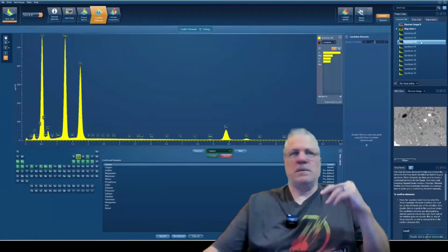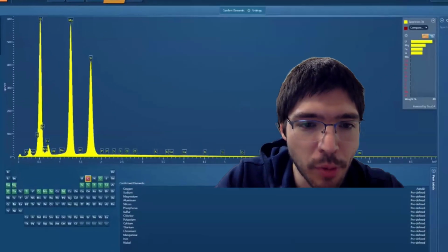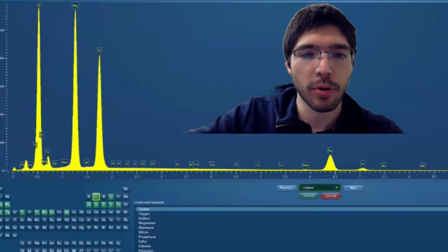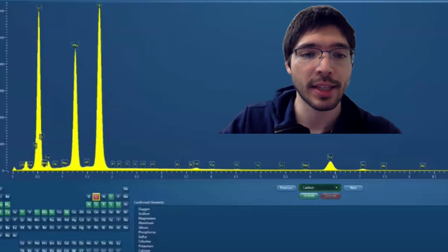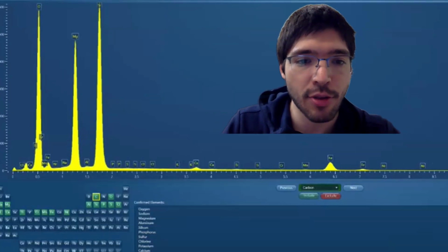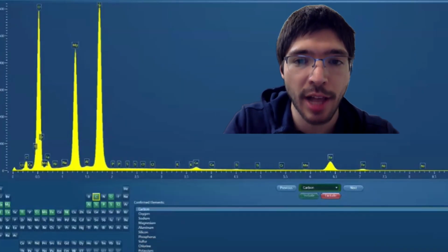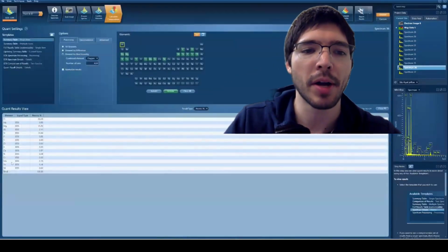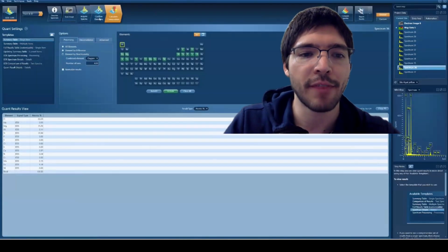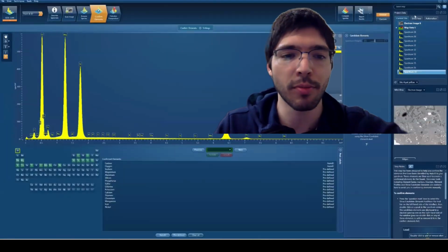Appreciate that. So there is one more thing I will say on this. What I'm doing at this point, after the images are exported, is going through every single spectrum from basically every data point we collected, checking each of them and removing any random elements that may appear. So you see I'm removing carbon a lot. That's because several of the spots did have carbon, but it wasn't enough to make an impact. If you don't remove it, it still shows up in that element list, and I don't really like that, so I remove it.